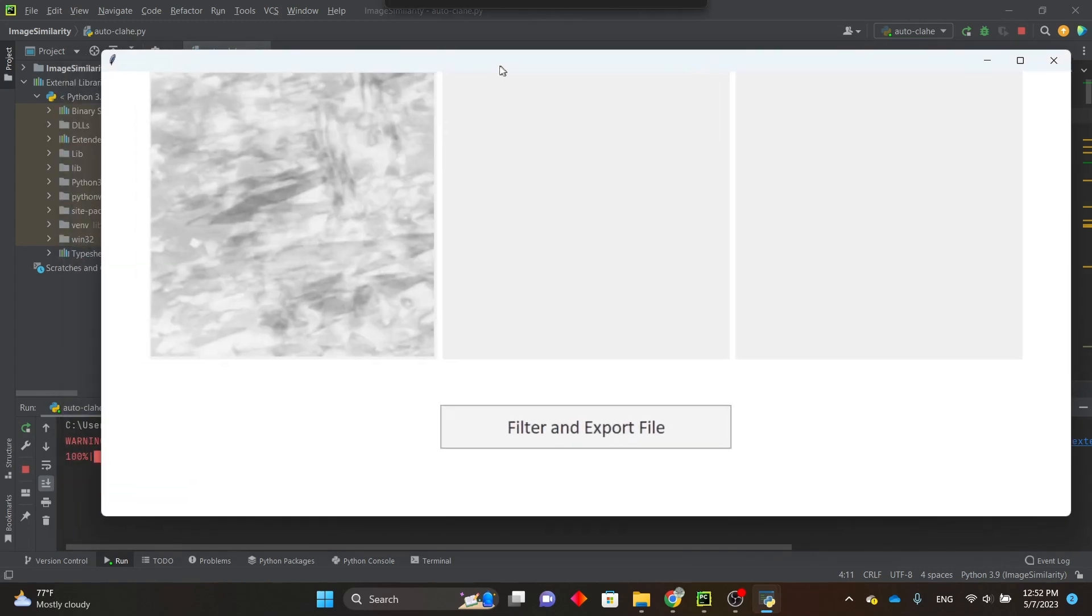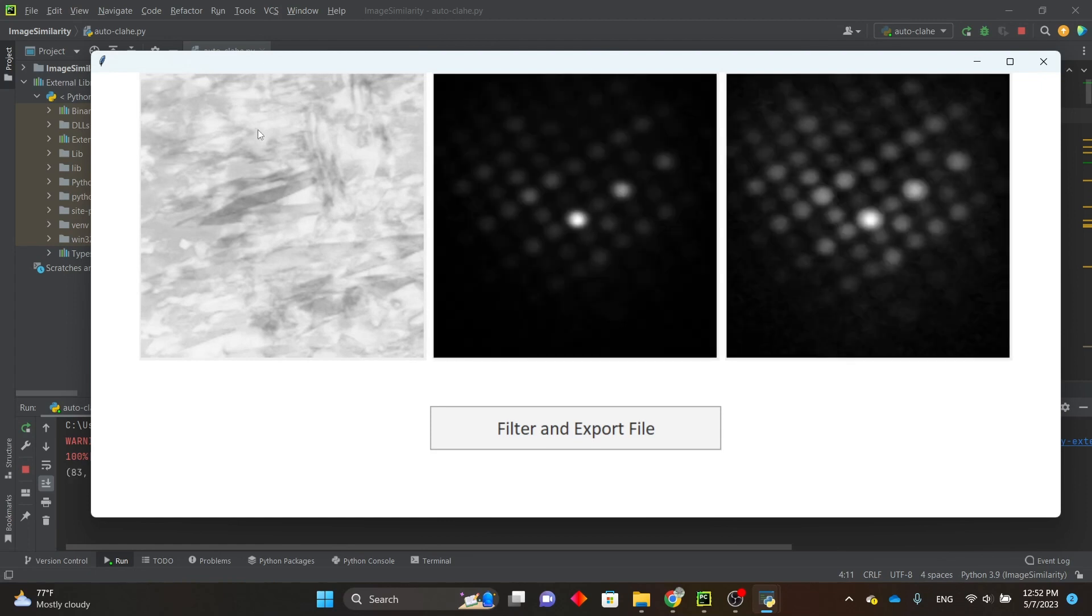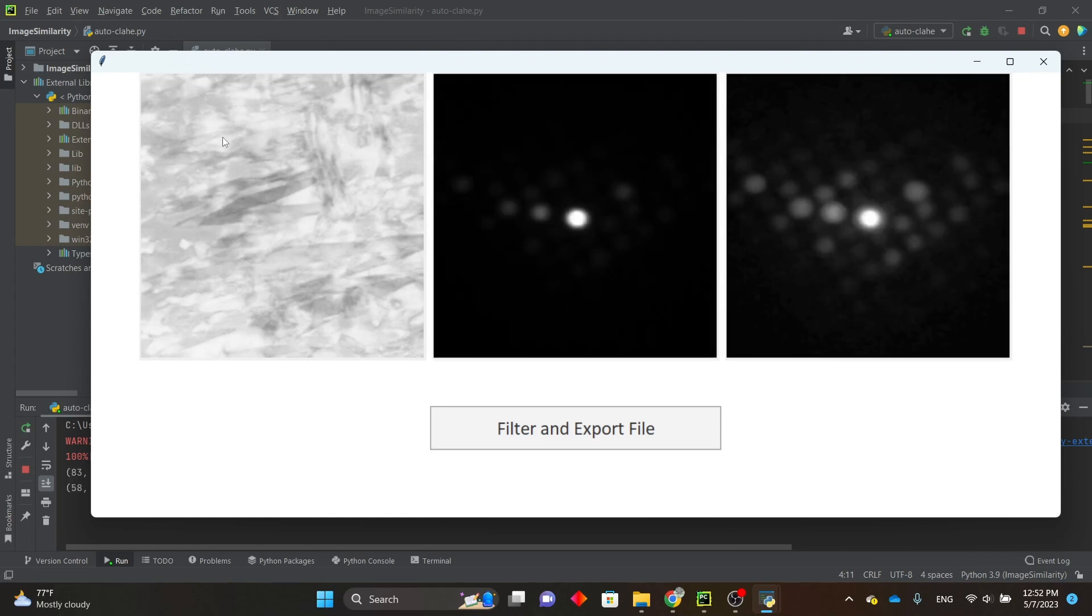So here is the preview window. You have the virtual brightfield image of your data set here on the left, and you can click anywhere on it to show the diffraction pattern at that pixel.